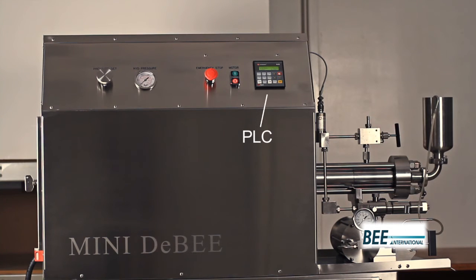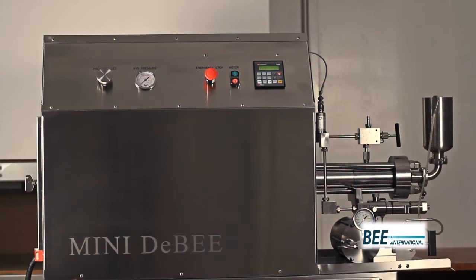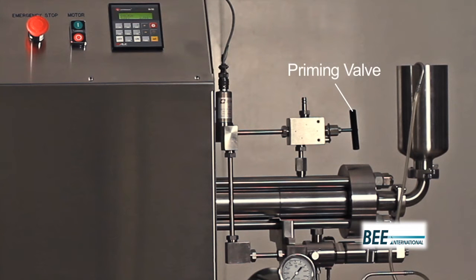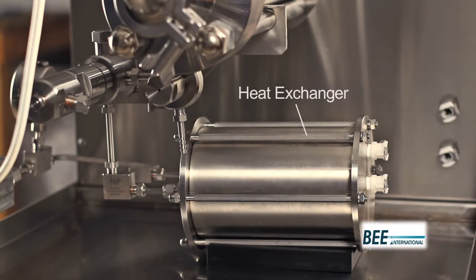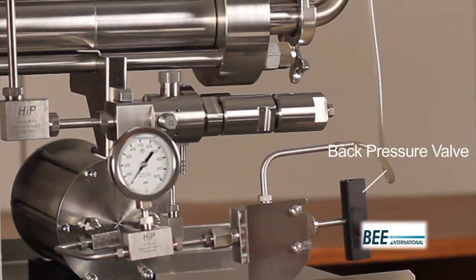On the processing side, we have the inlet reservoir, the intensifier, the priming valve, the emulsifying cell or EC, the heat exchanger, the back pressure gauge, and the back pressure valve.